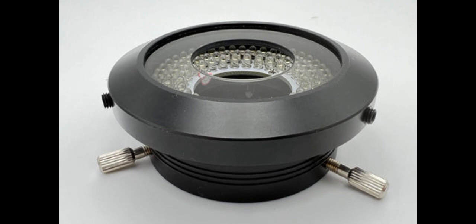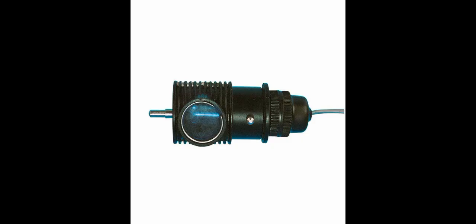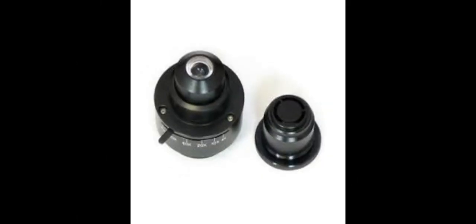It collects light from an outside source, using a low voltage of only 100 volts. It is utilized in place of a mirror.